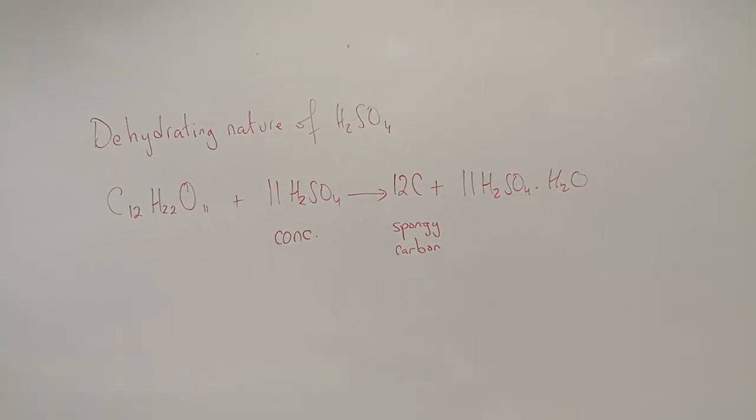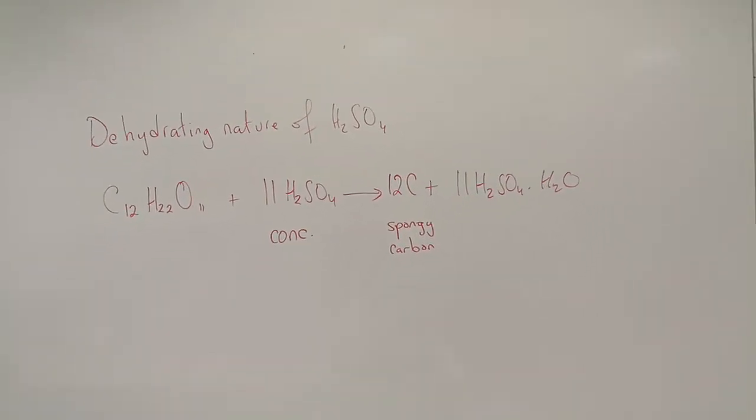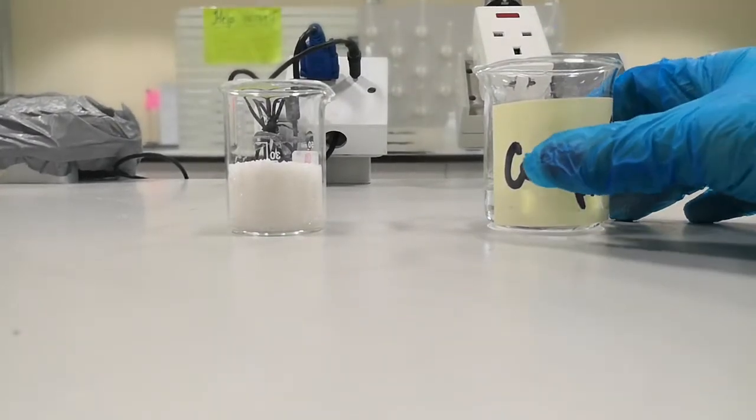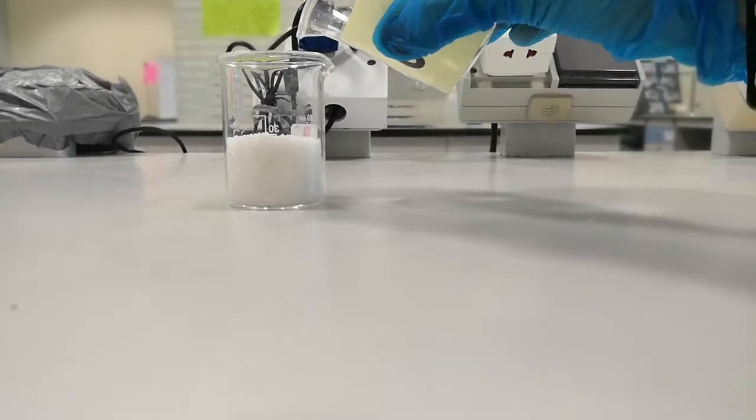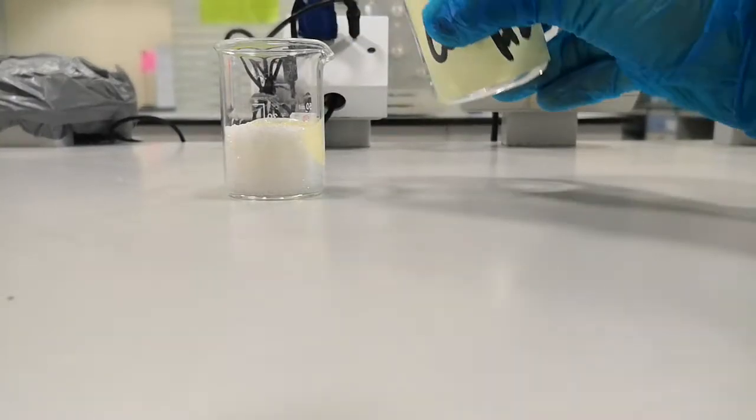Now I'm going to try this in real. Here we have sugar and concentrated sulfuric acid. I'm going to add a few drops of concentrated sulfuric acid to the sugar. This might take a while, but we will wait.